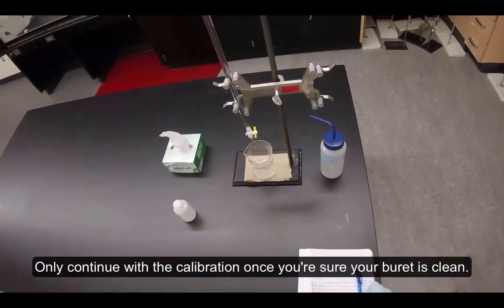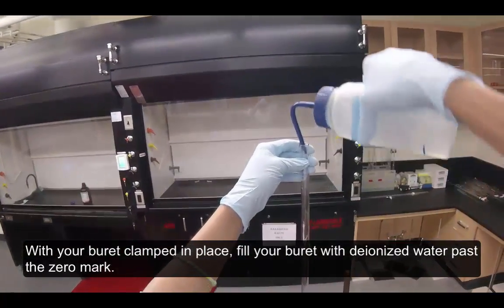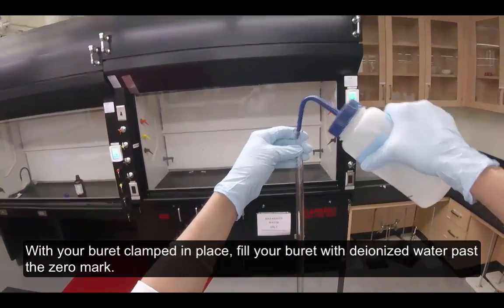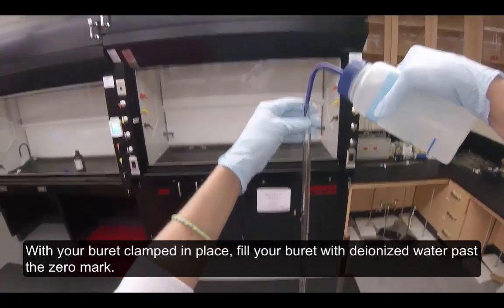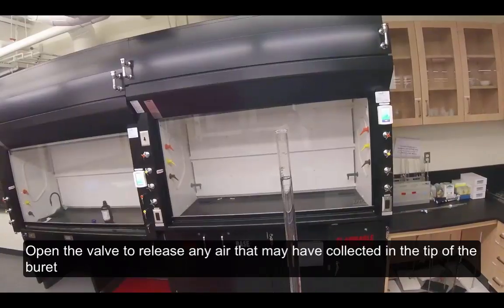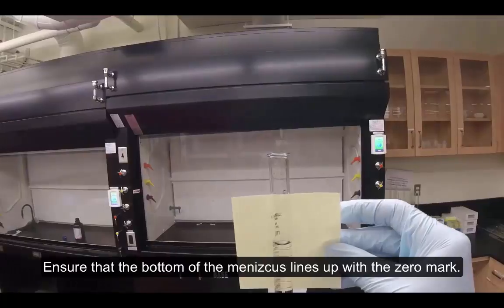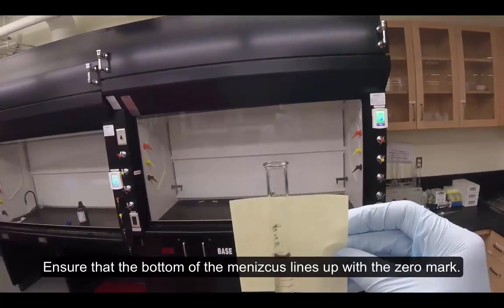Only continue with the calibration once you're sure your burette is clean. With your burette clamped in place, fill your burette with deionized water past the zero mark. Open the valve to release any air that may have collected in the tip of the burette and lower the water level down to the zero mark. Ensure that the bottom of the meniscus lines up with the zero mark.